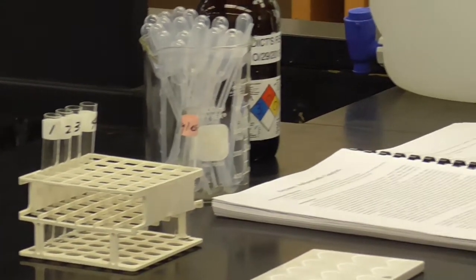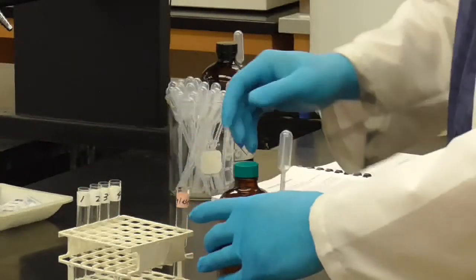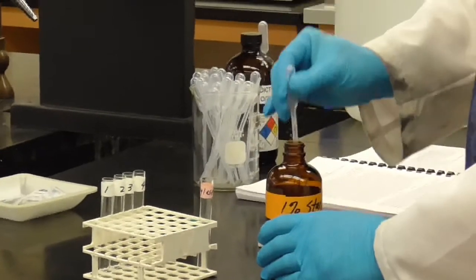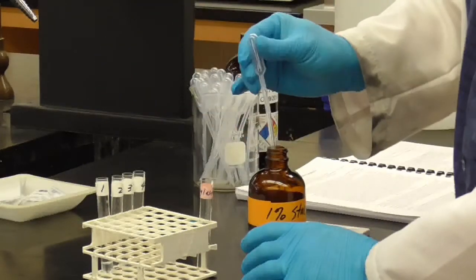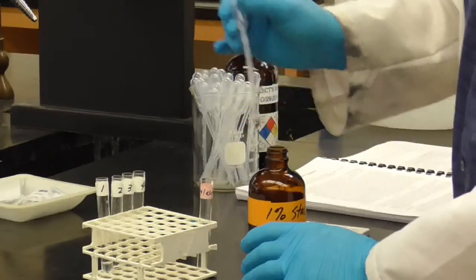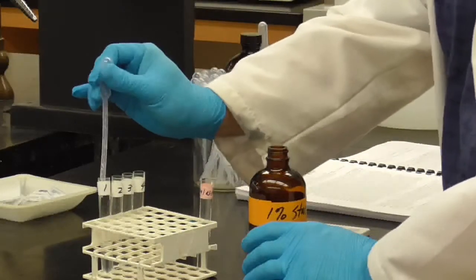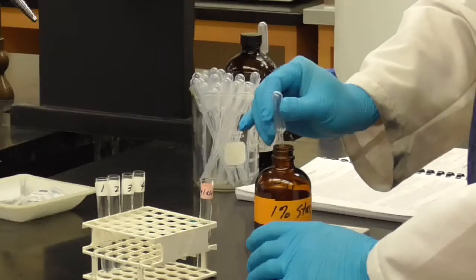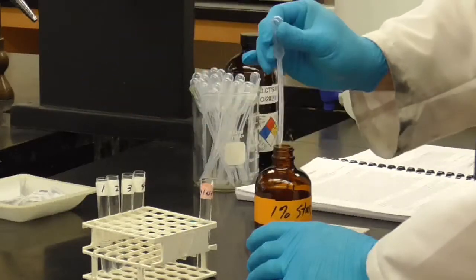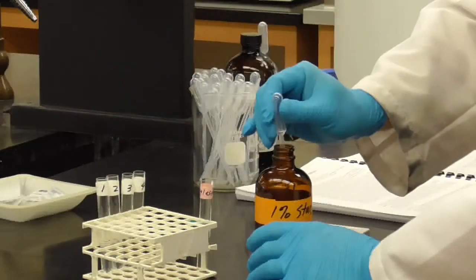Step 1 says place 3 milliliters of a starch solution, and here we go. Here's my starch solution into each of 4 separate test tubes. So here's my 4 test tubes, 3 milliliters in each one. Okay, so there's 1 milliliter, 2, 3. 1, 2. And again, we don't need to be super careful on the volumes here. We want to have reasonably about the same in each test tube so we can compare them.